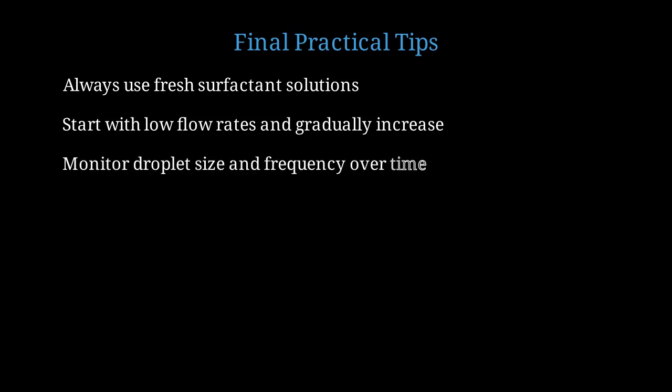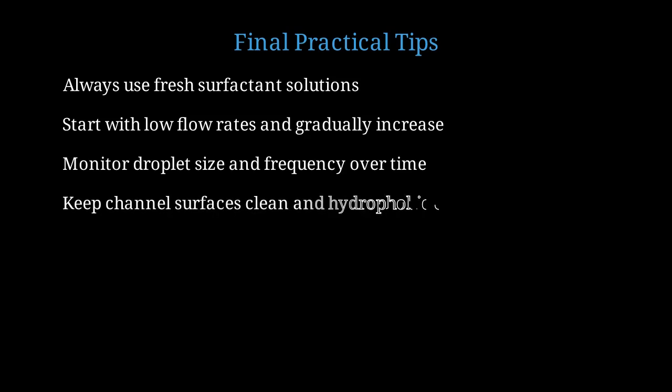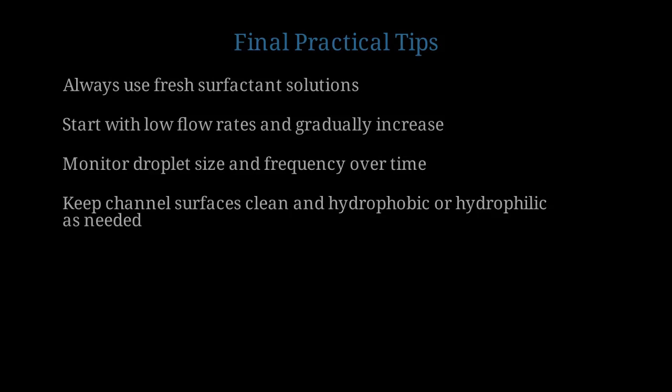Monitor your droplet size and frequency over time. Drift indicates instability that needs addressing. Keep your channel surfaces properly treated. For oil in water emulsions, you want hydrophilic channels. For water in oil, hydrophobic surfaces work better.